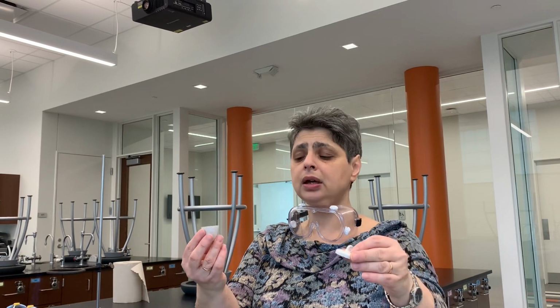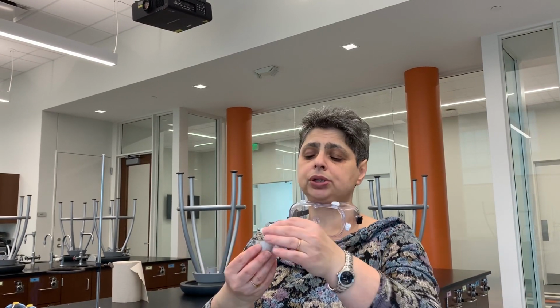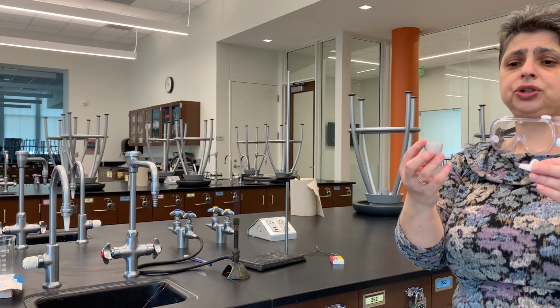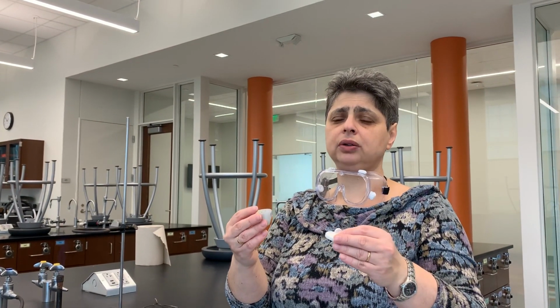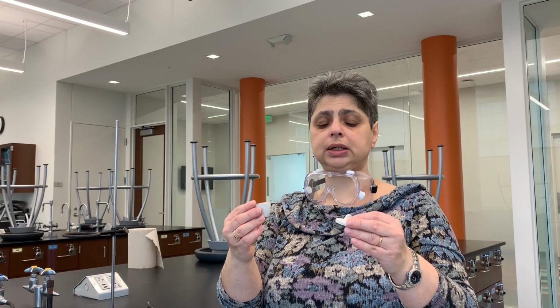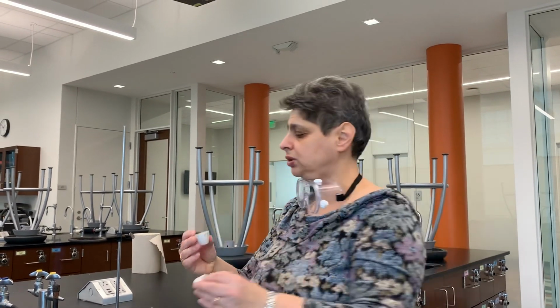I pre-weighed the crucible and I have the mass, which again will be given to you. So I'm going to first do what's called ignition of the crucible. Ignition of the crucible is done when an empty crucible is heated with the Bunsen burner, which I have prepared here, in order to burn off any impurities that the crucible might contain. This is done to further improve the accuracy of our experiment, to make sure the impurities will not interfere with our mass of barium sulfate that we're trying to determine.